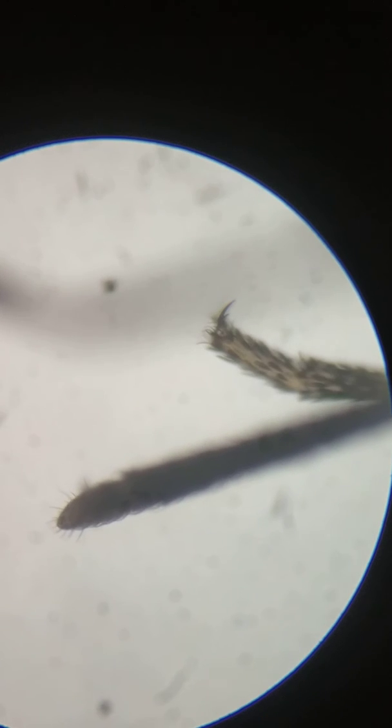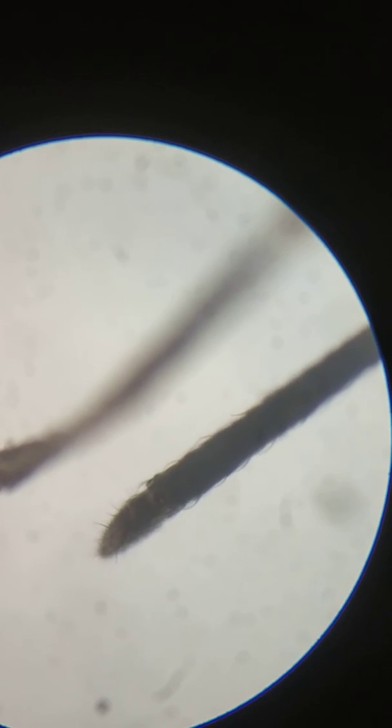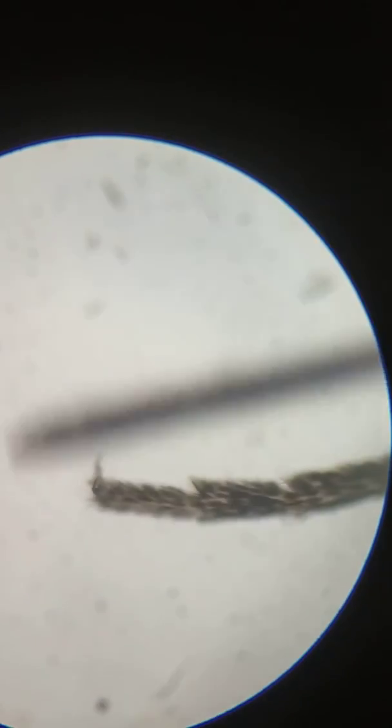This is the proboscis with which it sucks blood. This is the proboscis with which it sucks blood. It's a long tube as you can see, beginning from the head itself.